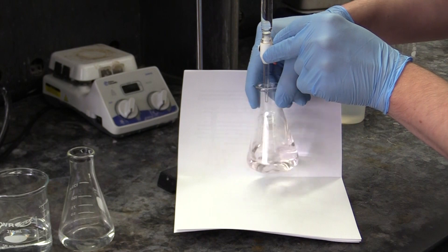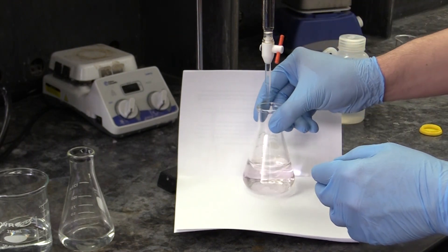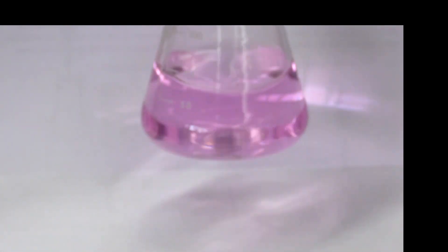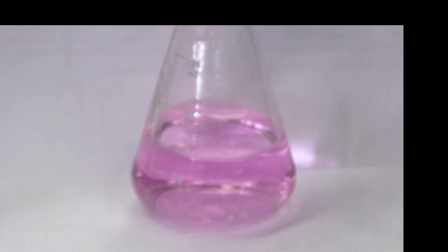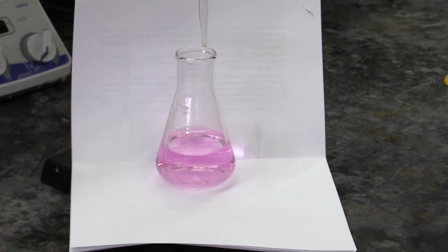One more thing. Your titration's endpoint will be a very pale magenta color that is just visible against a white background. If you add too much sodium hydroxide, you may overshoot, and your solution will look like this, with a prominent, obvious color. Unfortunately, if you are very close to the endpoint, even adding just one full drop can cause it to overshoot.